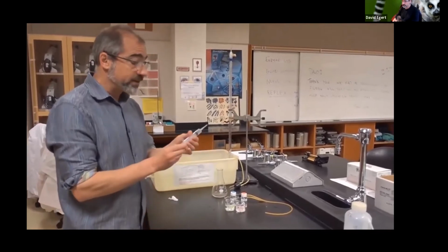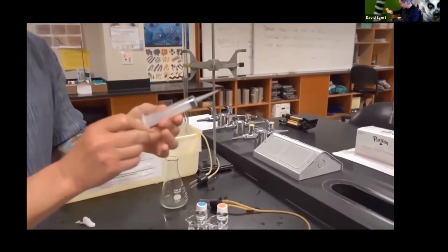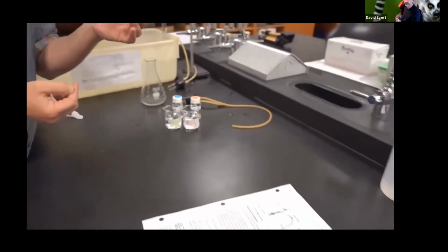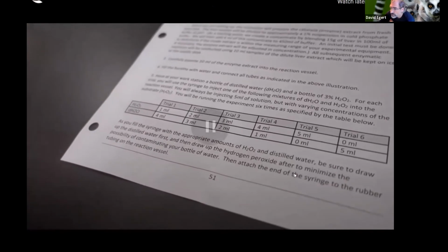And then I'm going to need my appropriate dilution of my substrate, which I'm going to put in my little syringe here. To illustrate, I'll show trial 2. Trial 2 is going to be 2 mils of hydrogen peroxide, 3 mils of distilled water. This is what I was talking about when we discussed the independent variable.